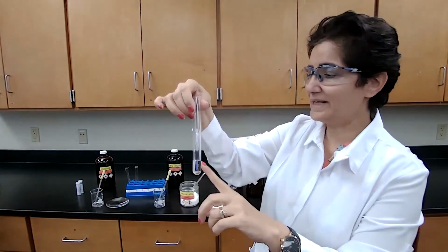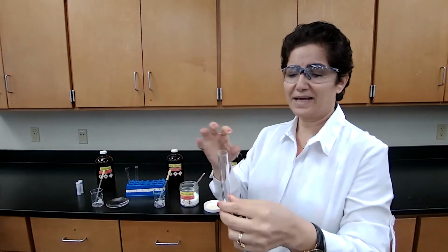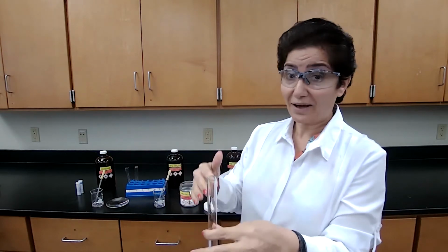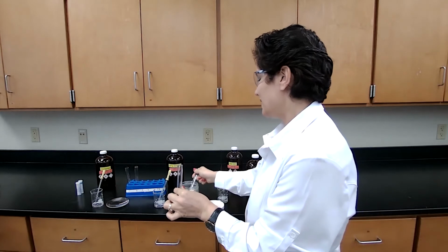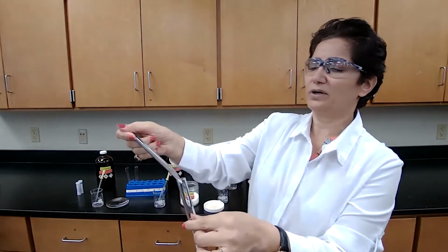Now, HCl with benzoic acid. Benzoic acid is weak acid, HCl is a strong acid. Normally, if I want to precipitate this to get it out of the solution, I would add strong acid. It's not expected to dissolve, but again, I have to do experiment in order to come to conclusion that it's dissolved or not.